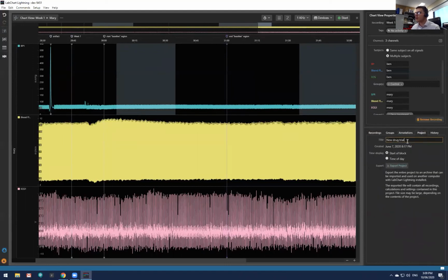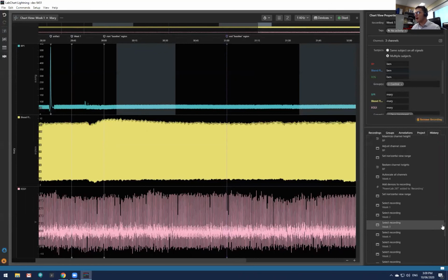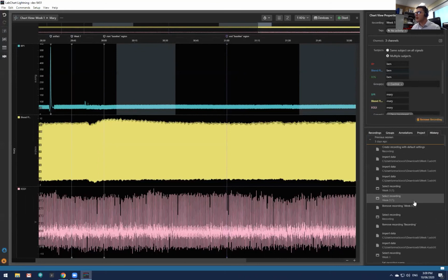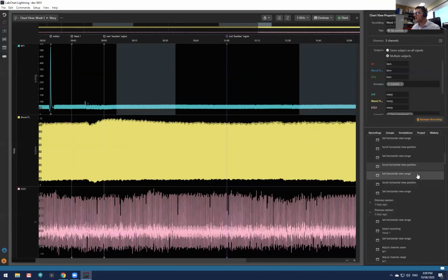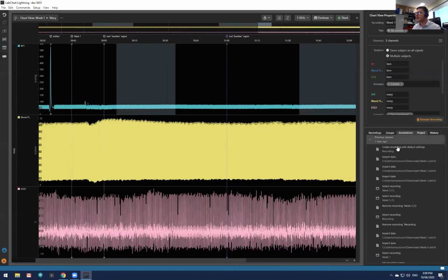Project, you can change the name of the project, that's no problem at all. And the history option, which I was mentioning earlier to you, is that I can actually look through the history of this whole recording at every point, and I can actually see what was going on. So I've imported data here, I have made a channel here, I have adjusted the vision, what I'm seeing, adjusted the channel. So I can actually right click on any of these and revert to here, and it'll go back in time to that point. So I'm not going to do that for the moment, but I can do that. That's really easy to do.